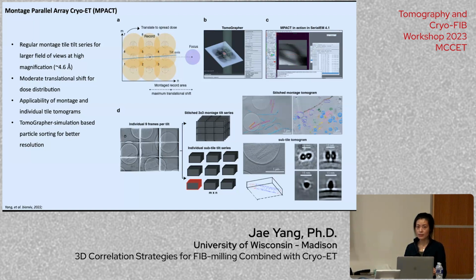And I know that people keep telling you that, oh, the thinner the better. But there are more studies that show you cannot go beyond a certain thickness of the lamella. It's going to damage your structures. And also you're going to lose the volume information that you wanted to preserve in your TEM. So it's not always the thinner the better, unless you are looking just at a tiny little protein.